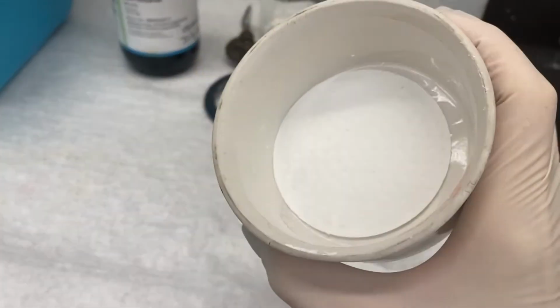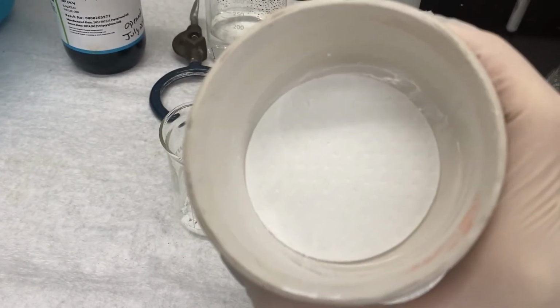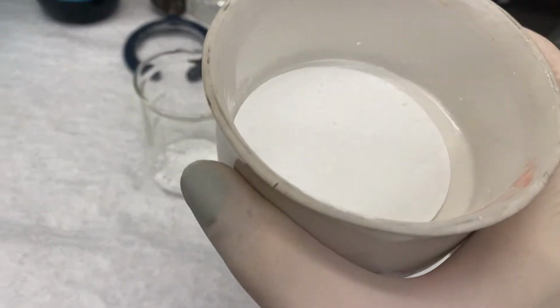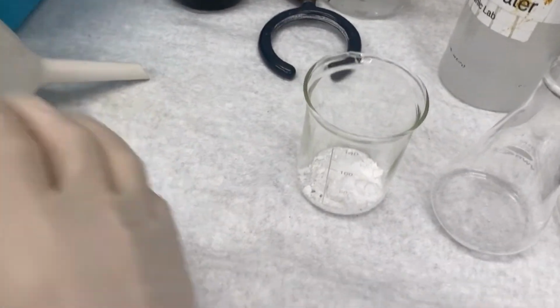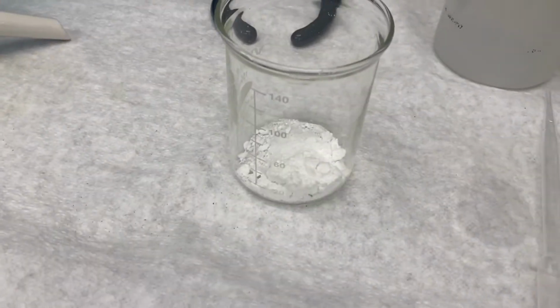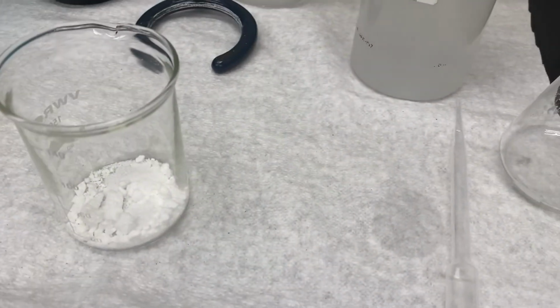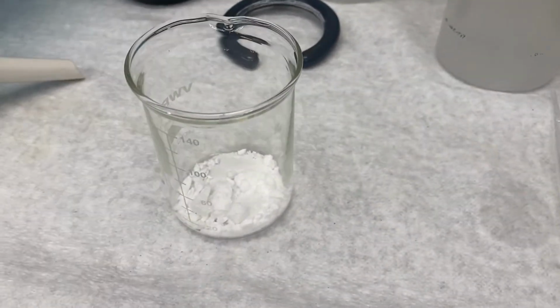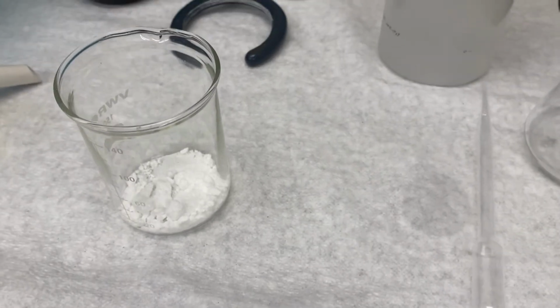Alright, so I've scraped out what I could out of the Buchner funnel. You see there's some material still left behind, but it's pretty small. But yes, there is a little bit of transfer loss. But mostly what we have in here is our product. Now, in the procedure it says we need to do a separation, a purification of our crude product.